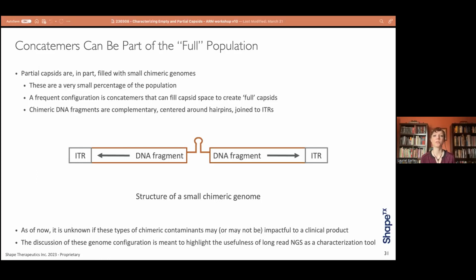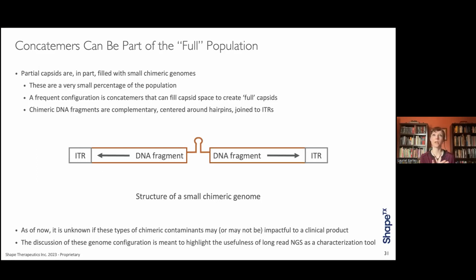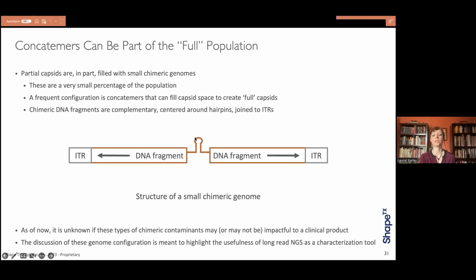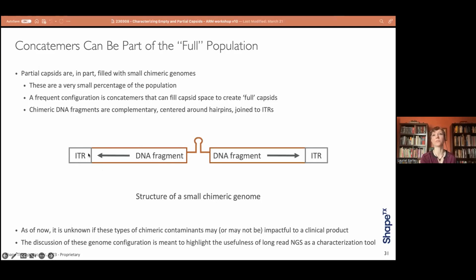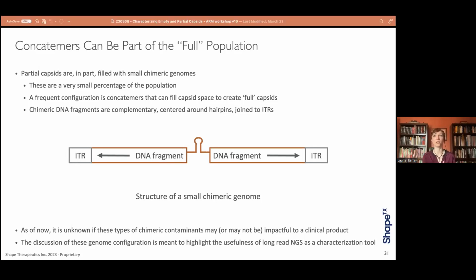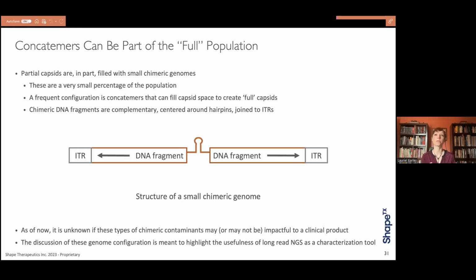And so the discussion of these is really meant to highlight the usefulness of long-read NGS as a characterization tool and not meant to imply any kind of implication of what these might do in a therapeutic setting. But the point here is that what we see are a lot of snapbacks, like we just described with the payload rearrangements, where we have an ITR that's been chimerically joined to some DNA fragment that contains a naturally occurring hairpin that is inducing that template switch so that it's then moving back along the recently copied DNA. And because these are small, they can form concatemers and actually fill up a capsid, much like we saw earlier in the gel with the single-stranded AAV that was undersized can form concatemers. This can happen with other types of genomes as well.